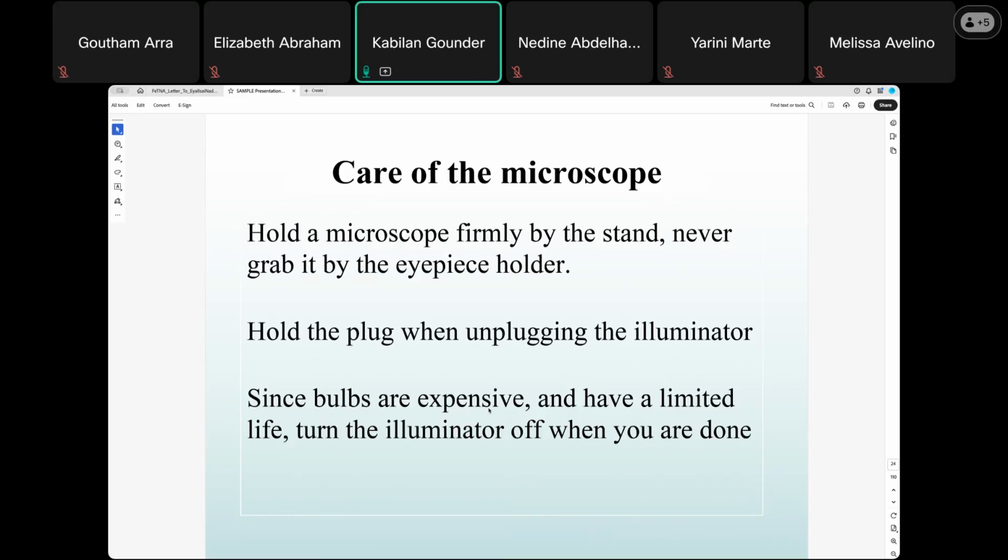So people increase or decrease the light intensity depending on their sample. But when you go there and see your samples, you have to reset all of them to your conditions.